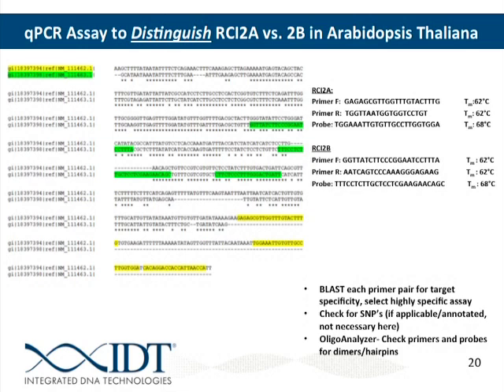And for the sake of time today, I'm not going to repeat that with all of the primers, but you get the idea of what you'd need to do. You would check the forward or the reverse primer and probe for secondary structure and all possible heterodimer combinations.